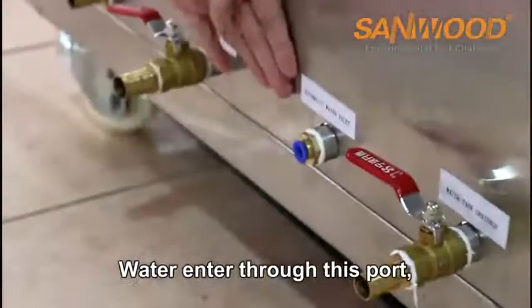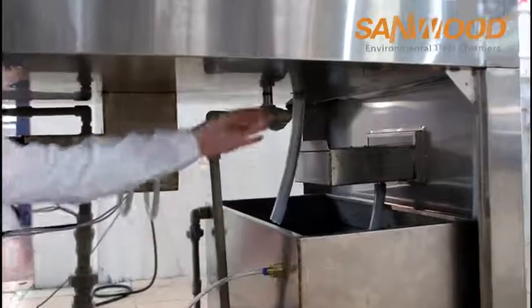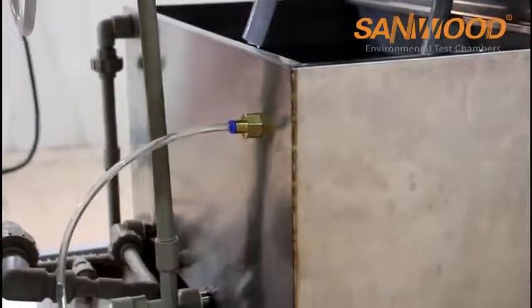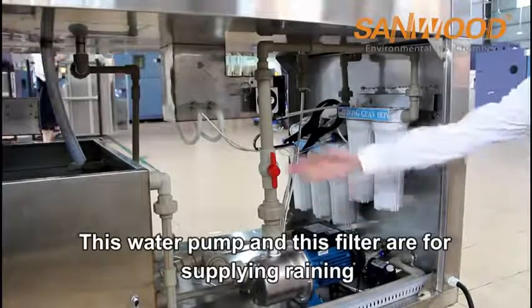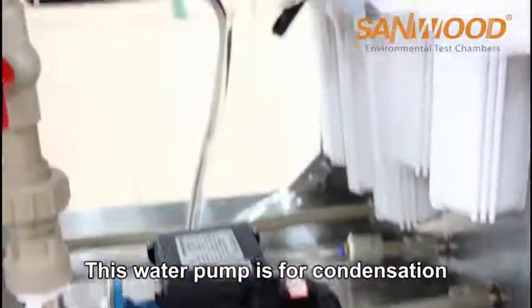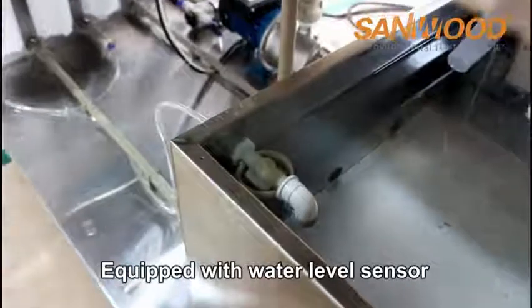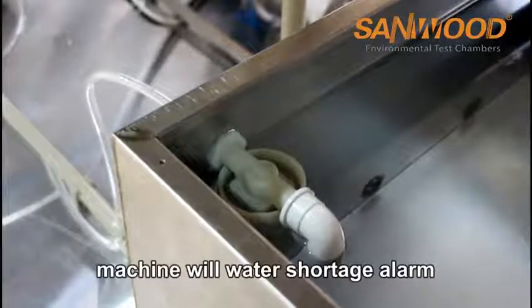Water enters through this port, then goes through a water filter, then into the water tank. The drainage system includes a drainage pipe for the water sink and a drainage pipe for the water tank. This water pump and filter are for supplying the rain function, and this water pump is for condensation. The machine is equipped with a water level sensor — once the water level falls below the set level, the machine will trigger a water shortage alarm.